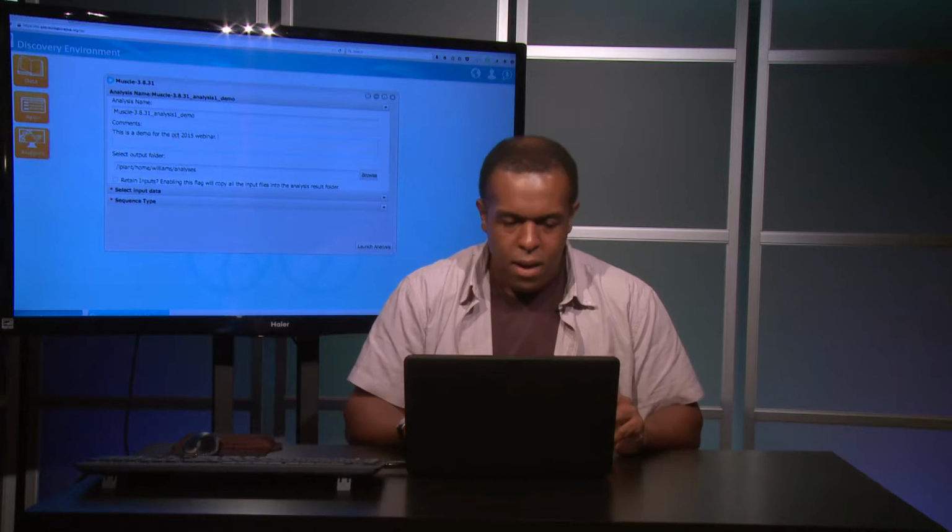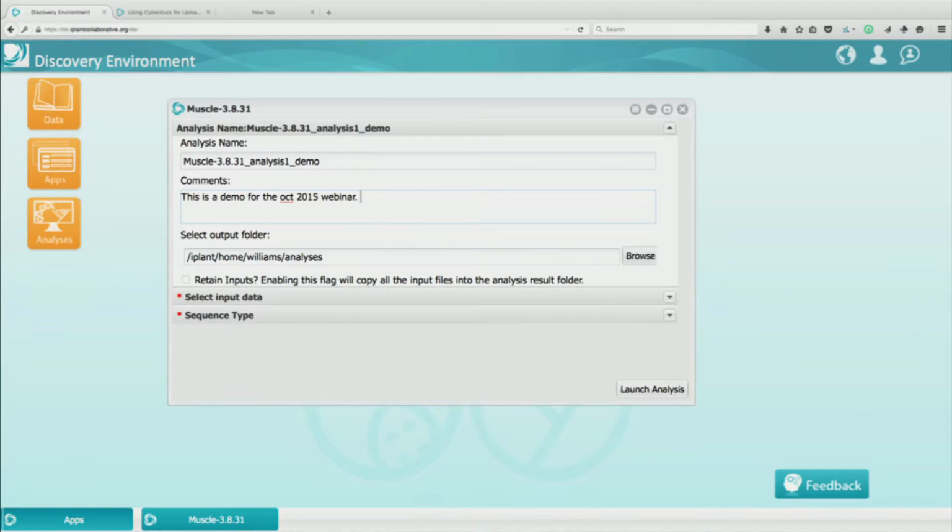Okay, so back here, adding some comments. This is just a demo for the webinar. There's an output folder where my results are going to go. In the main, I leave it as default, but let's say you're sharing all of your analyses with your entire lab. You might have a lab folder, and you could change this so that that's your lab folder that everybody's shared with. This application is very simple.